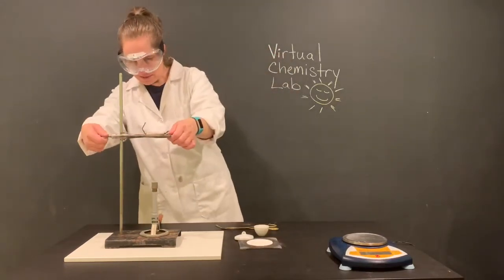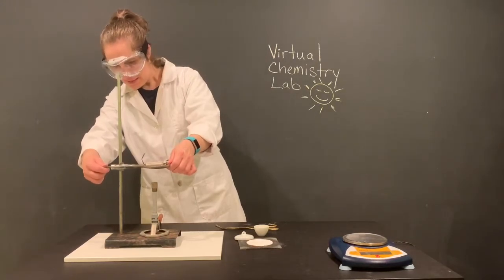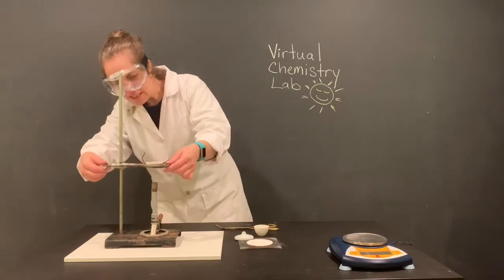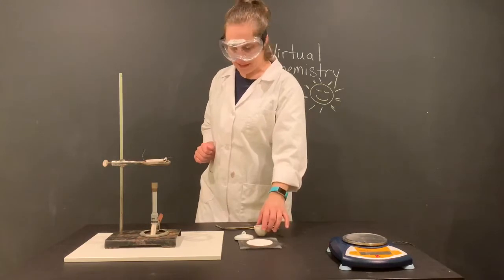We want the bottom of the flame to kiss the bottom of our crucible. So I'm going to bring this down, estimated here, just about there, just so that we have a few inches and it will still kiss our flame, or the bottom of our crucible there.